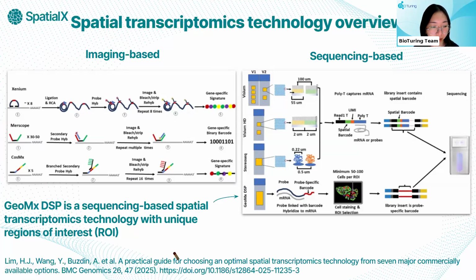Down here, I've left the citation to a review article, which I think is pretty helpful in summarizing the pros and cons of each of these technologies if you're trying to figure out which spatial technology is best for you.